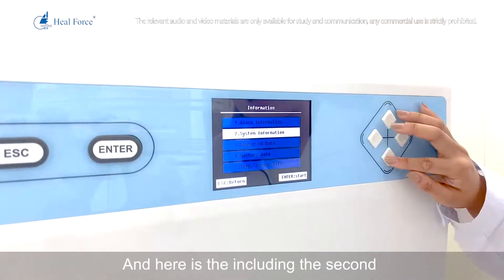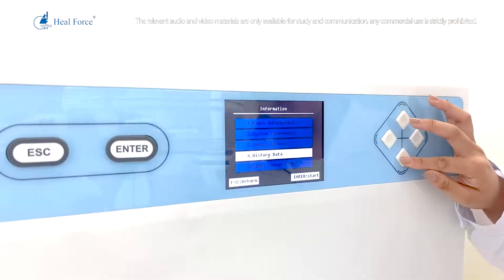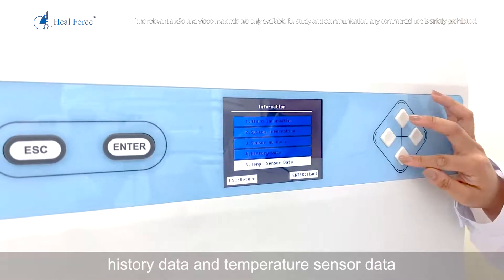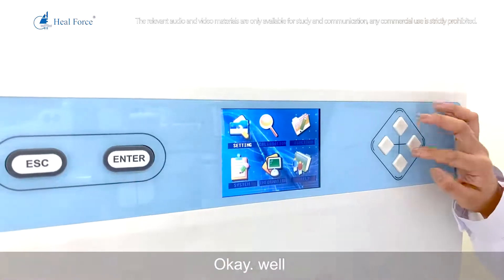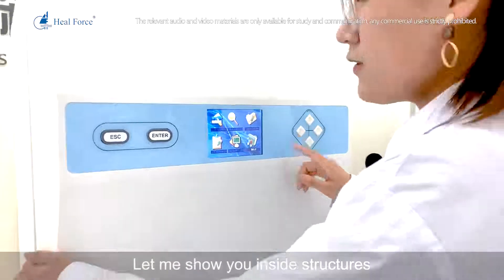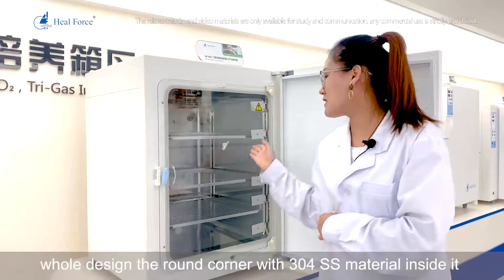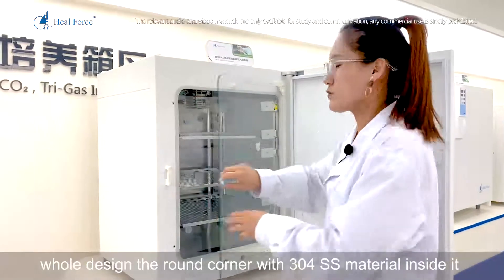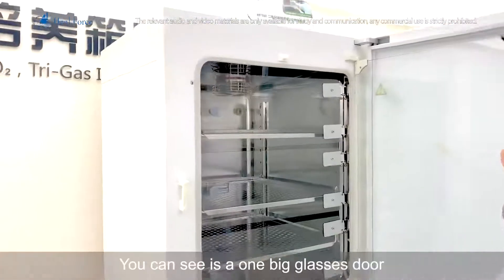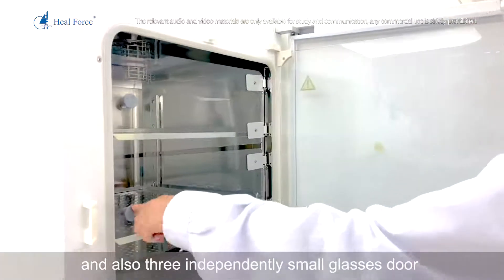The system information section includes sensor AD data, history data, and temperature sensor data. Now let me show you the inside structure. The HealForce incubator features a round-corner design with 304 stainless steel material. It has one large glass door as well as three independently opening small glass doors, so you can operate each sample section independently.